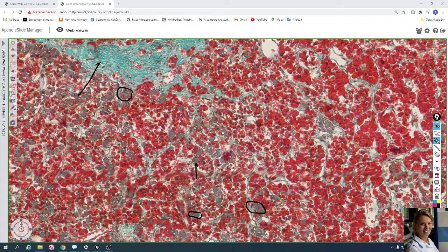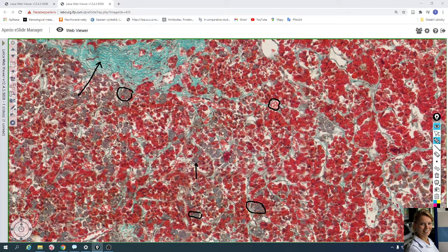Here you can see connective tissue with capillaries. The capillaries are located between the cells of the anterior lobe — for example, here and here are capillaries.